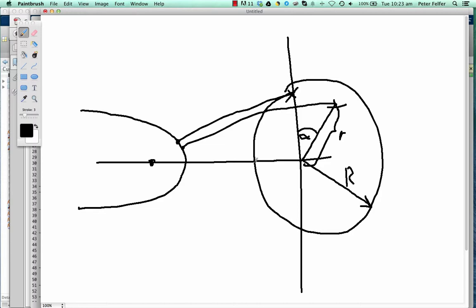I'm saying that because with atom probes with microelectrodes, your microelectrode might have some contamination, and your hit area might look something like this. This is your entire detector, and your hit area might look something like this. I don't know, maybe not as ugly as this, but ugly enough.